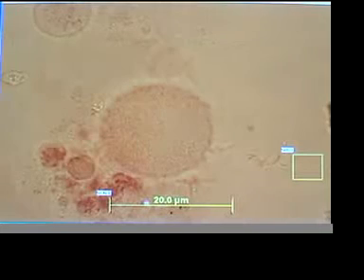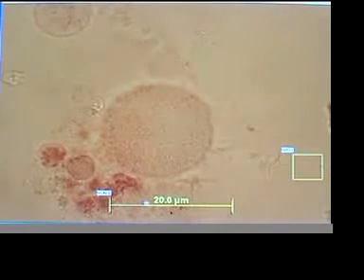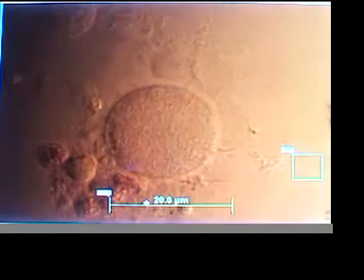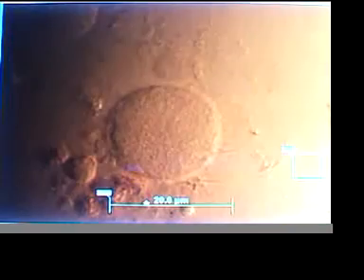I might be able to do a little trick with the filter and give you a little surface resolution. Let's see. Yeah, look at that. I'm doing a sort of halfway onto a red filter, and you can see a sense of texture.